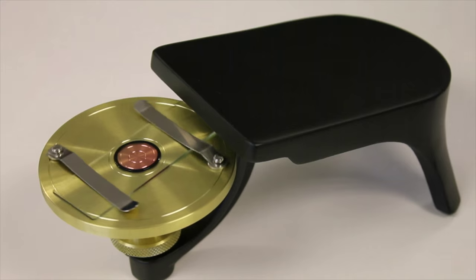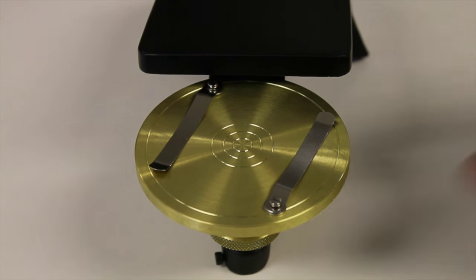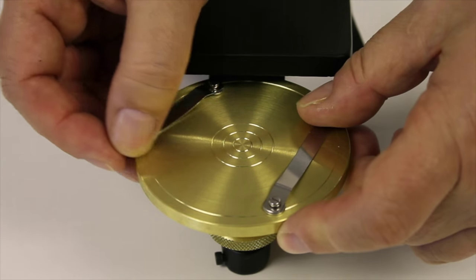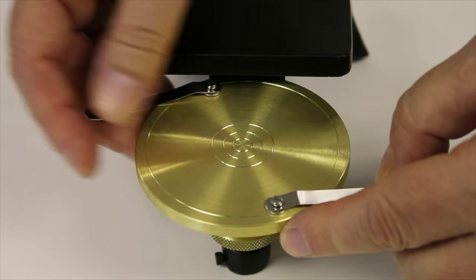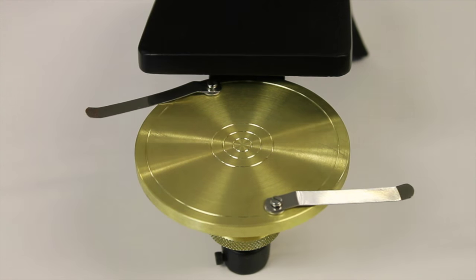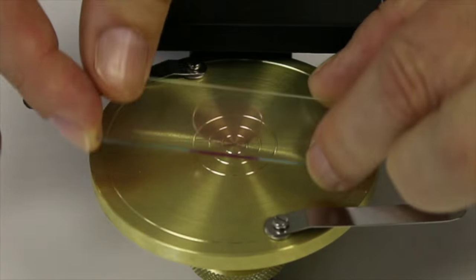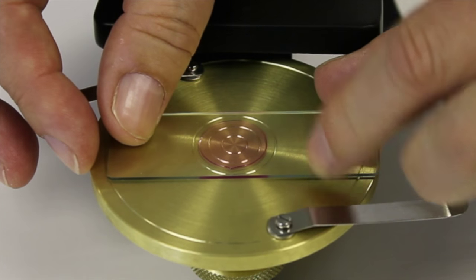The brass table has two slide clips that hold the slide firmly to ensure there is no movement during spinning. There is a series of circular center rings to assist with centering the coverslip around the spin point of the table.